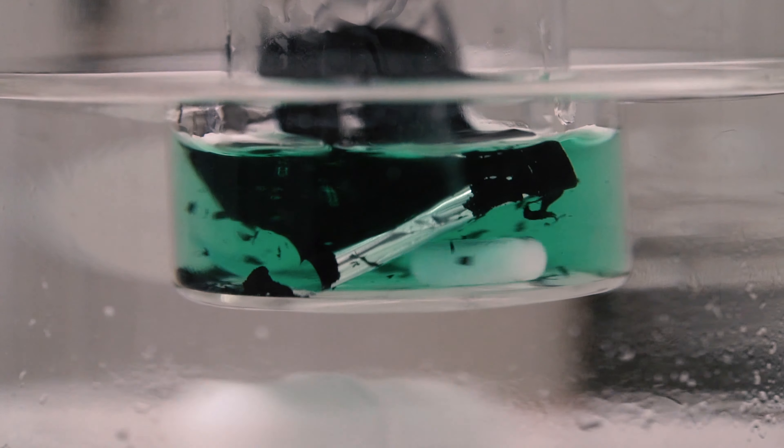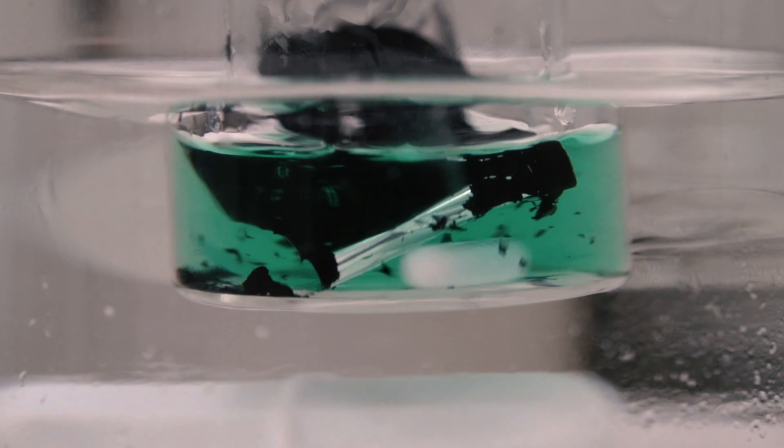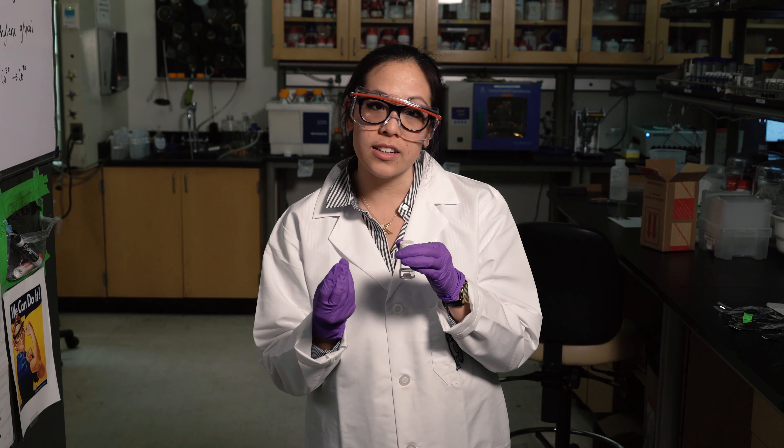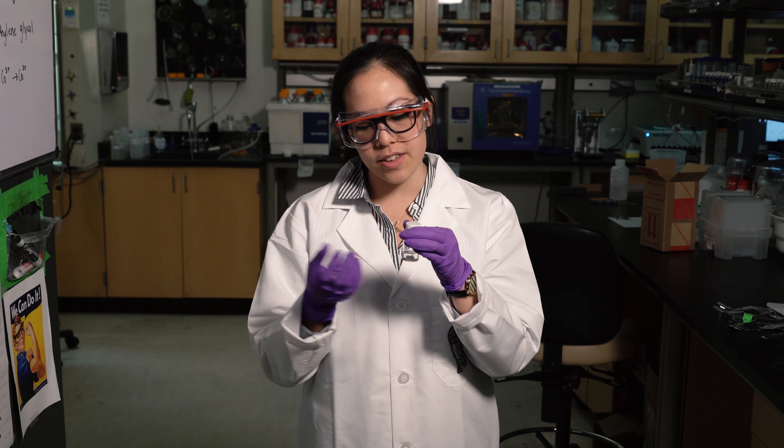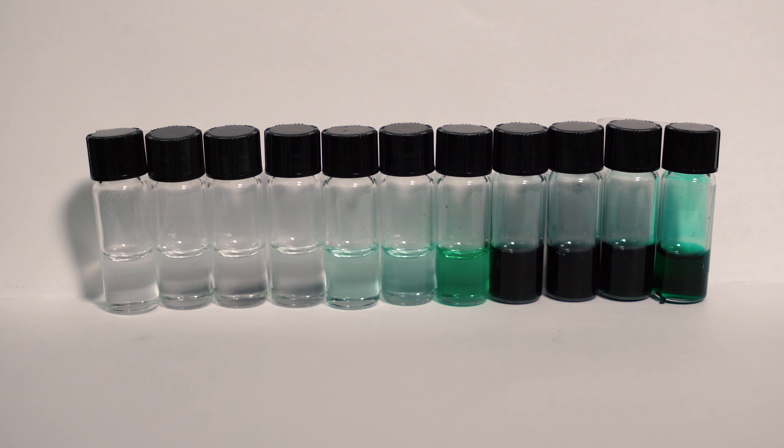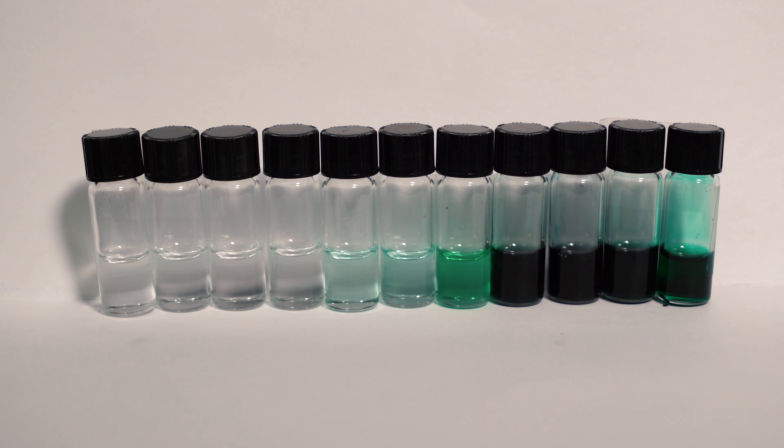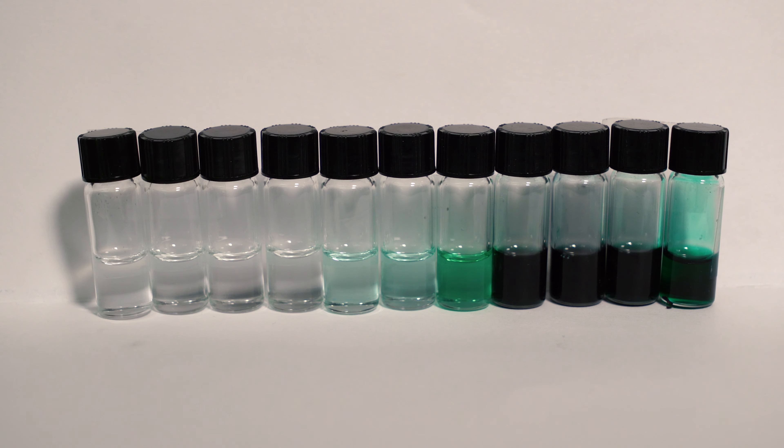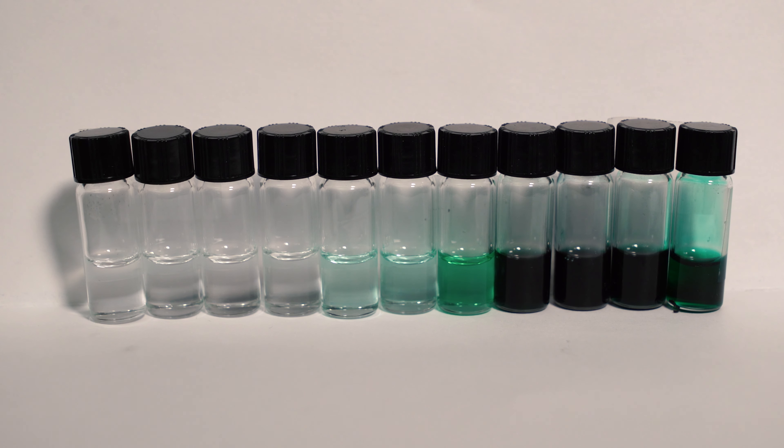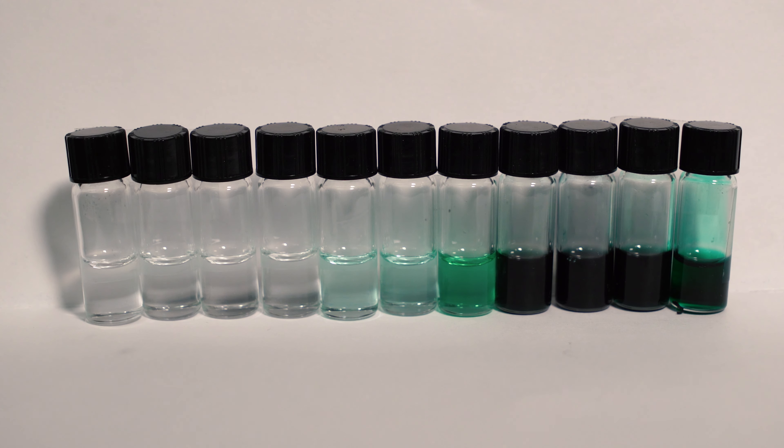You just add your cathode powder or your entire cathode foil into this eutectic, and applying a little bit of heat, you can see that the color changes from clear to a bluish-greenish hue, which indicates the dissolution of cobalt from your cathode. And the deeper the blue, the more cobalt you have leached into your solution.